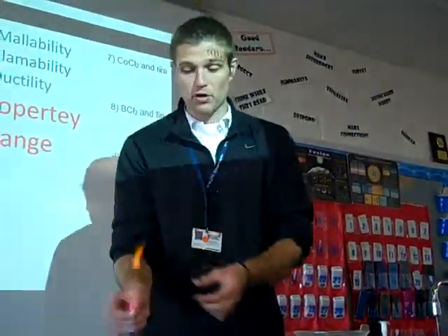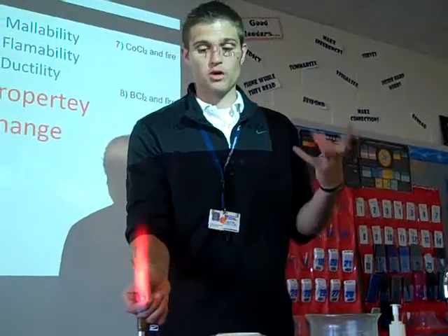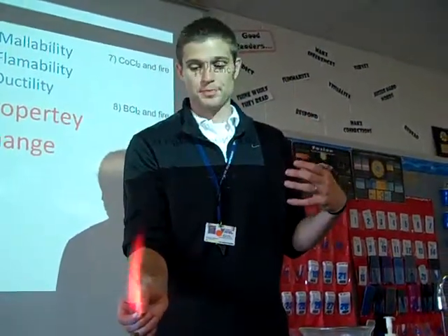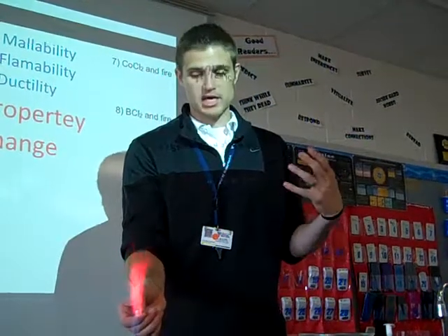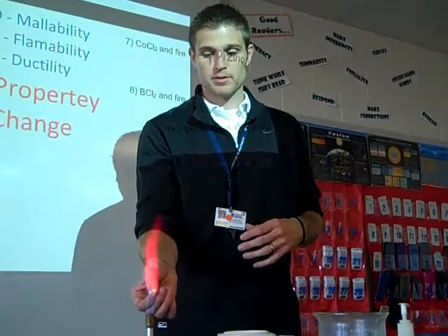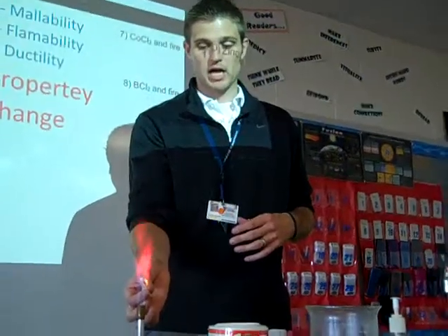Also, after a while, it starts to burn that orange again because there's no lithium chloride left, so it's going away. Is that how they also make red fireworks? This is one of the ways they can make red fireworks, yes. This is like a pinkish color right now. Yeah, it's awesome. Okay, so now the orange is coming in.